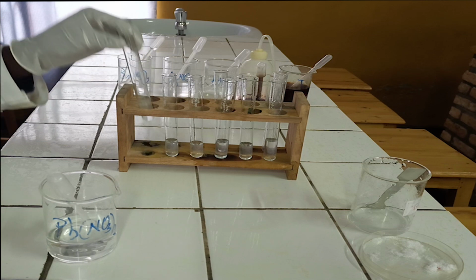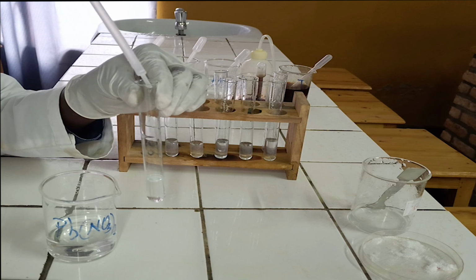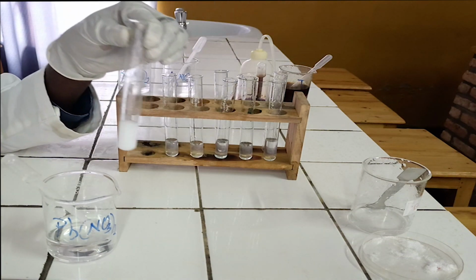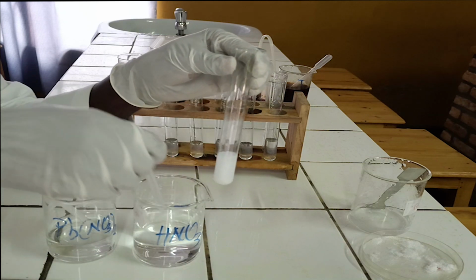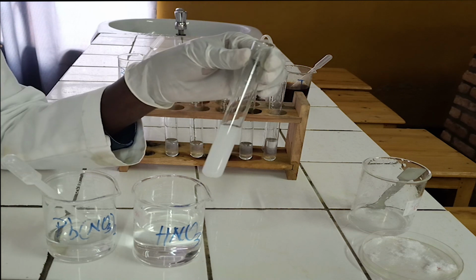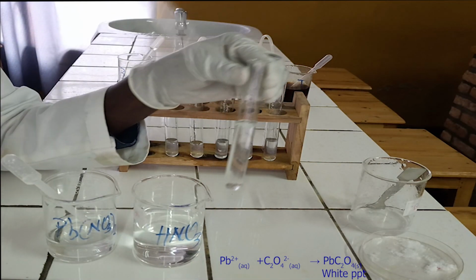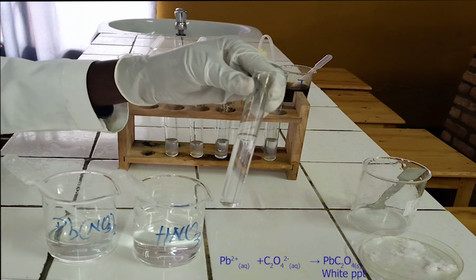To the first test tube, add few drops of lead nitrate solution followed by diluted nitric acid. As you see, lead nitrate reacts with oxalate ion to form white precipitate. The precipitate formed is soluble in diluted nitric acid without effervescence. Below, there is the ionic equation for this reaction.